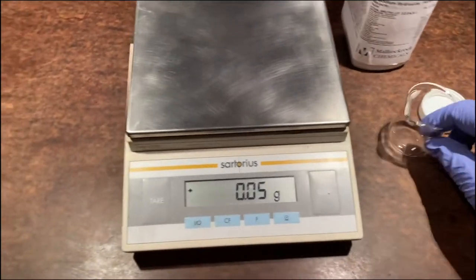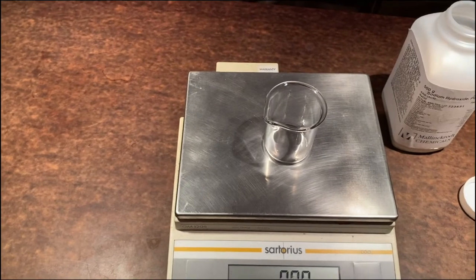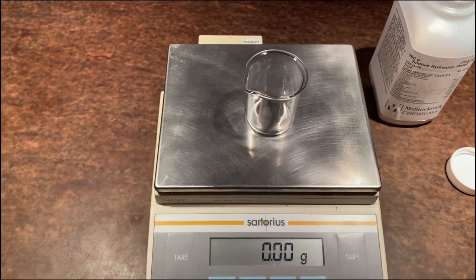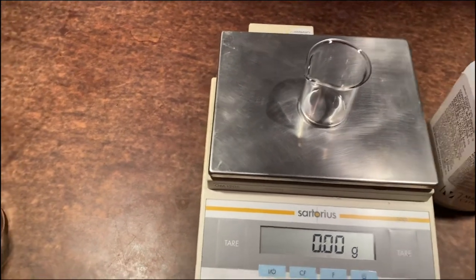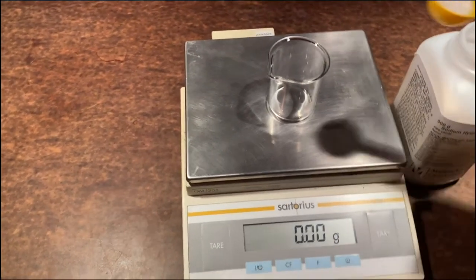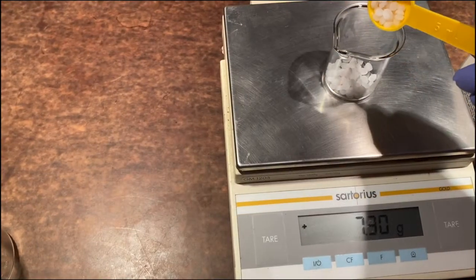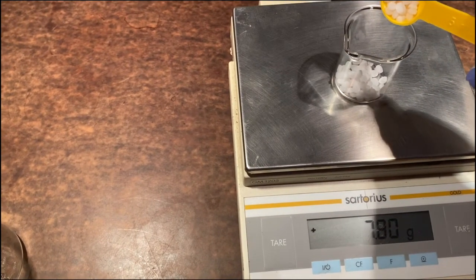I'm now ready to weigh out hydroxide and make up a solution. Notice I'm keeping the solid hydroxide contained at all times, rather than trying to collect or clean up stray pieces. Most balances have a tare, but if not, we would need to weigh the empty container separately before adding solid, so we could subtract it from the total weight.